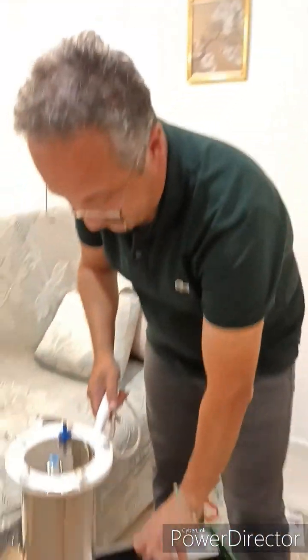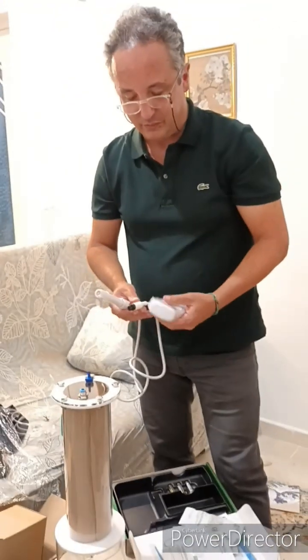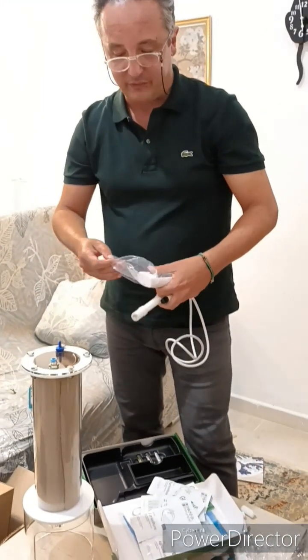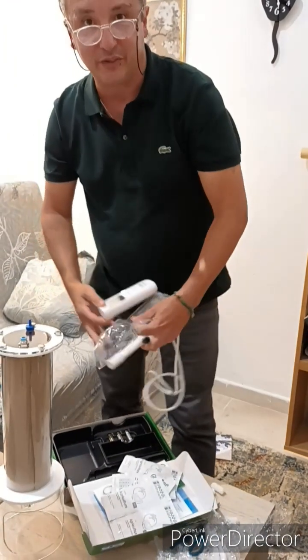This is the device — the reader. We can connect this probe to the reader; it is quite simple. They are standard parameters, but extremely important for our research.